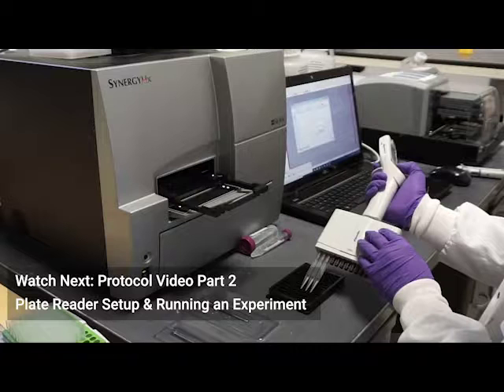Please refer to part two of the protocol video for instruction on plate reader setup and running an experiment.